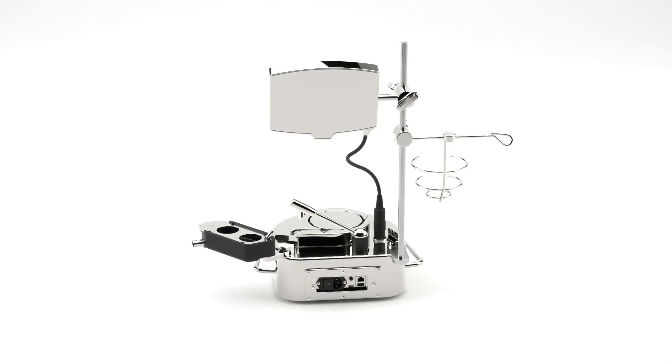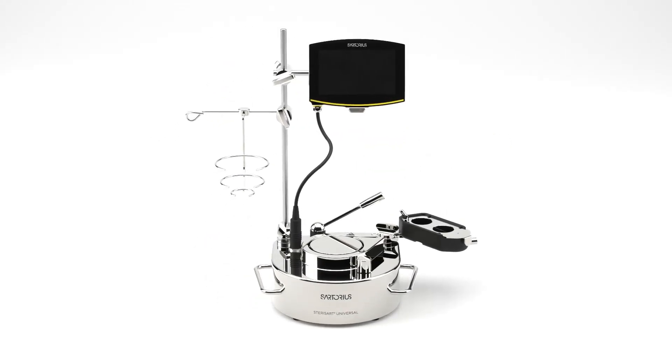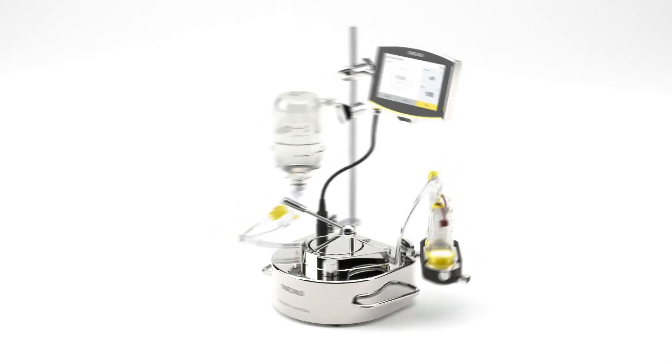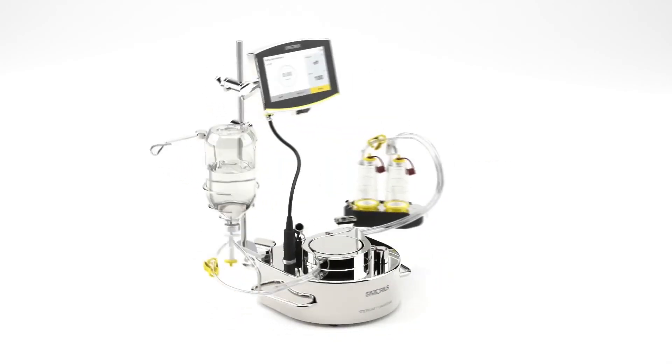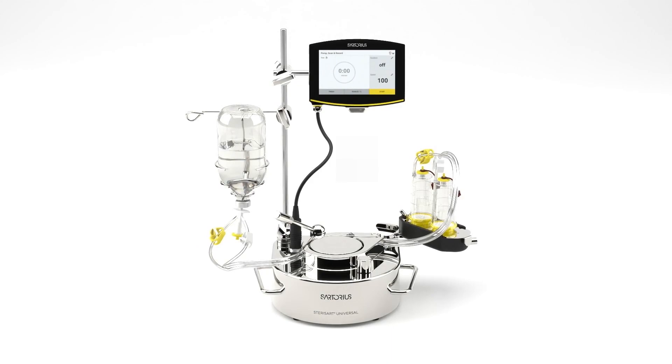At Sartorius, we are all too aware of your need and the importance of adhering to 21CFR Part 11 requirements. The Sterisat Universal Pump offers a robust suite of features to facilitate and ensure your compliance. In this video guide, we will walk you through some of the key features of the Sterisat Universal Pump, facilitating your journey towards ensuring compliance with 21CFR Part 11.